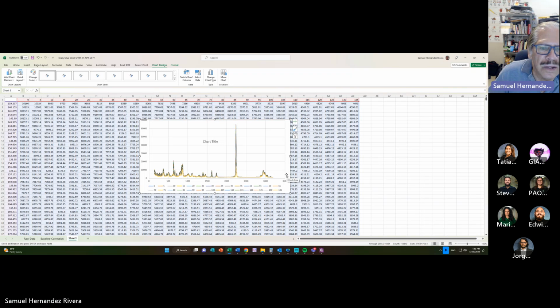Okay. Second thing I'm going to do is put a title on it.